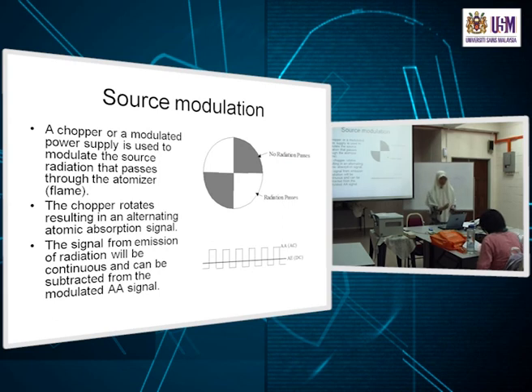The purpose of this is that the detector now knows that if light is at that frequency, it is from the source. Just like, say, you want to identify someone among other people, and you know that person is wearing a red shirt. Here the detector identifies the light source. If light comes in at that frequency, it knows it is from the source. And light that is not at that frequency is not from the source.